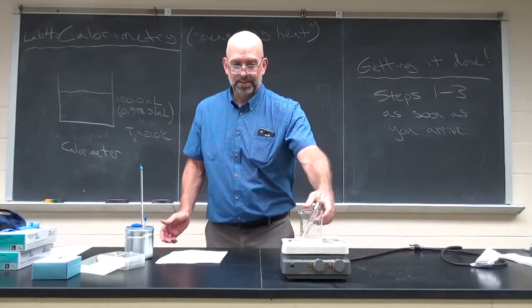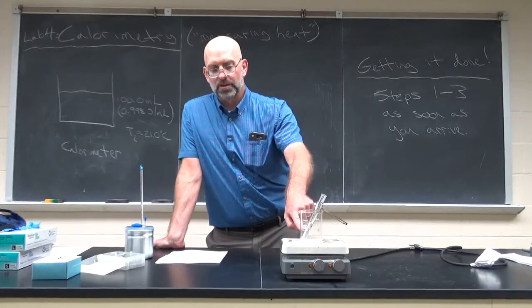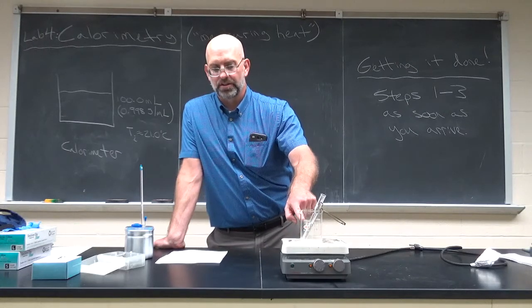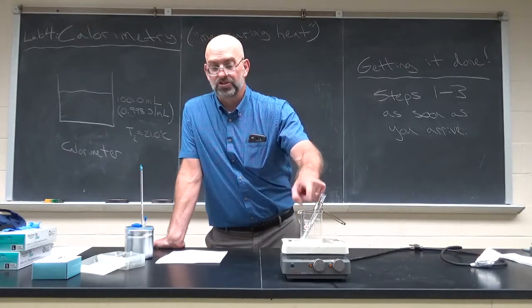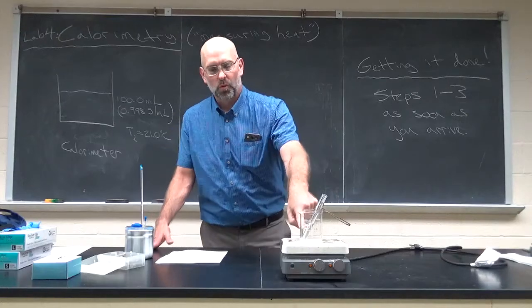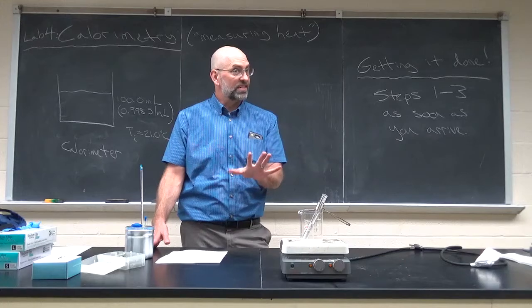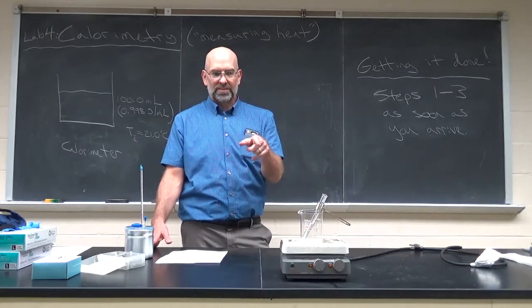Okay. The key thing is the beaker of boiling water. The water has to be above the level of the aluminum. If you don't put enough water in and only like half of it is submerged, the aluminum cylinder I mean, that won't work. So you want enough water, tap water is fine, because you're just heating it, it's not a chemical reaction. You want that in here. So you're gonna have this in here about 15 minutes, because what that does is that assumes that the temperature of the water, about 100 degrees, right, it's boiling, 100 degrees Celsius, about 212 Fahrenheit. We assume that that's going to be 100 degrees.